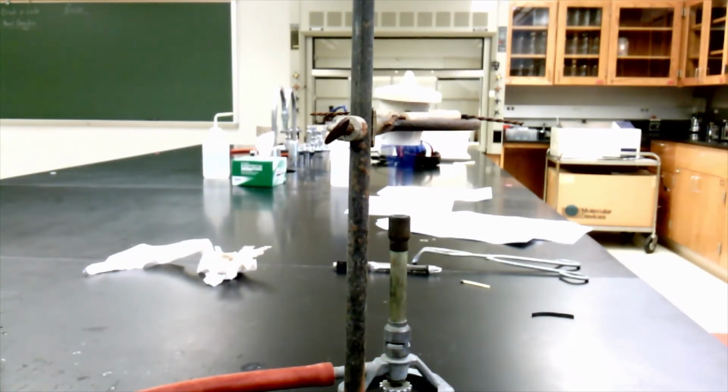We're going to come back when this thing has already heated all the water off and the crucible has already cooled, and I'll be ready to weigh my crucible with the lid to see how much that vessel weighs. It's really important that I wait until it's not hot anymore, though. You can never weigh things when they're hot because, one, you might warp the balance pan. You might mess up the balance and make it less accurate in the future.